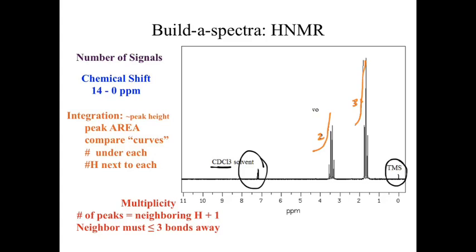So the next part of this is going to be our fun part, our multiplicity. The number of peaks equals the number of neighboring hydrogens plus 1. So let's go through, and I'm going to label this as our red hydrogens here, and we'll call these our purple hydrogens here. So red hydrogens, let's get our information back out there. We know we have a hydrogen bound to a question mark was our chemical shift. Our integration said there was another hydrogen bound to that question mark.